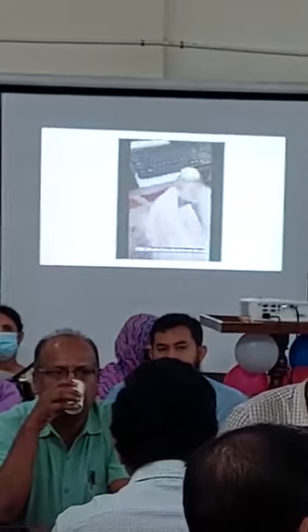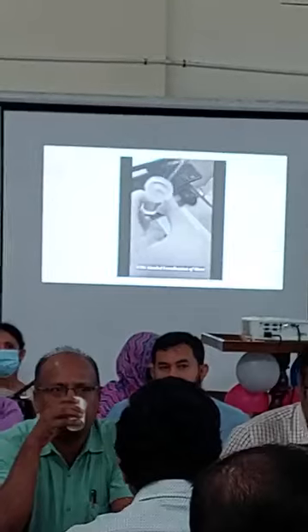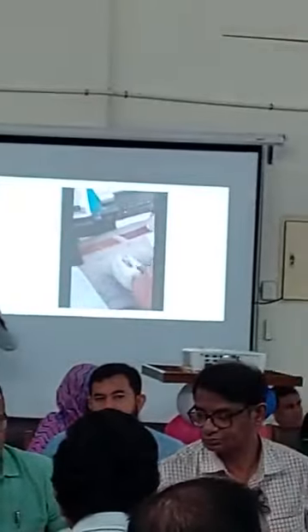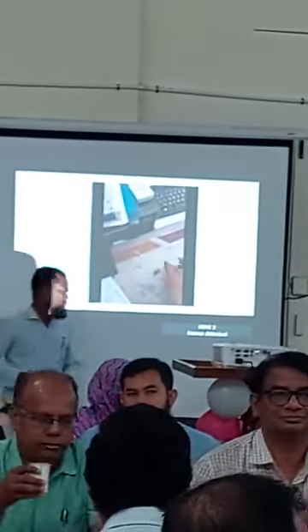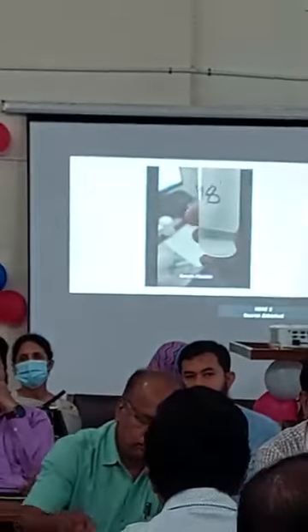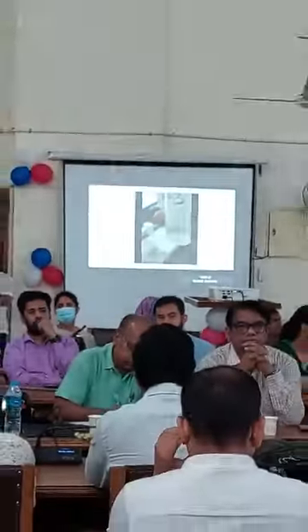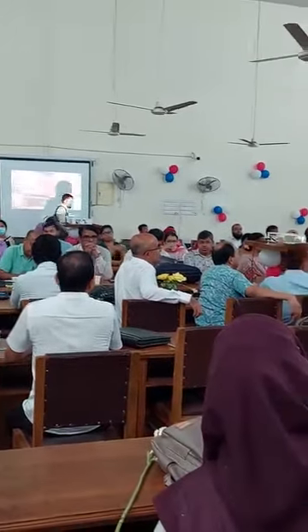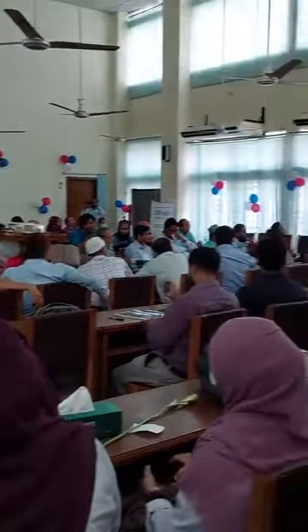It was a case performed by me, and immediately after collection, it should be fixed in 10% formalin as soon as possible. Otherwise, it is very difficult because the tissue will be autolysed. So this is the punch biopsy sample. Thank you very much for your patient hearing.